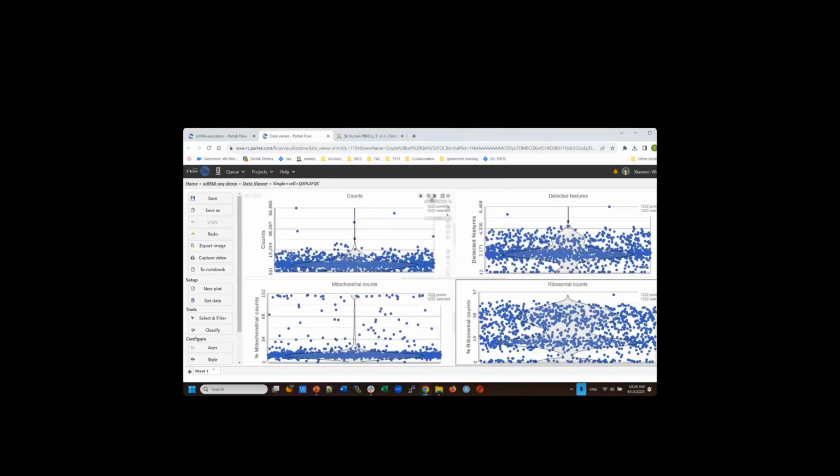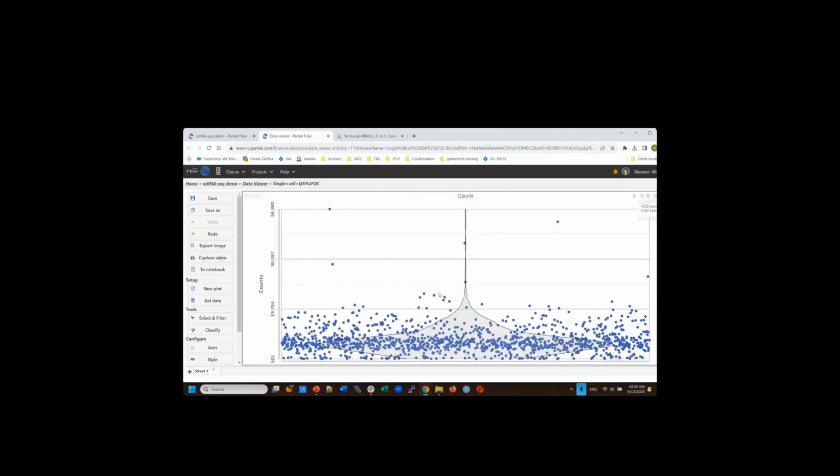On the right side, you can duplicate the plot. You can download this, export the plot. You only export this particular one, and then send it to a notepad, a notebook. We have another tab called notebook. You can write notes for your project. Also, if you want to focus on this particular plot, you can click on the maximize button and then see some more details.